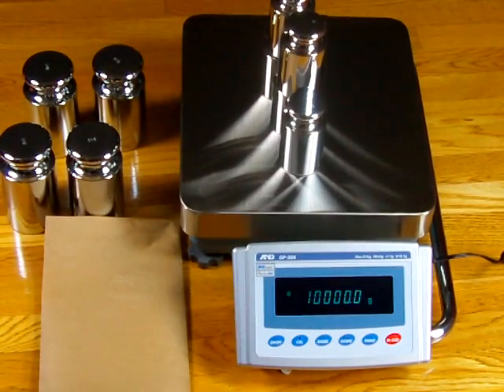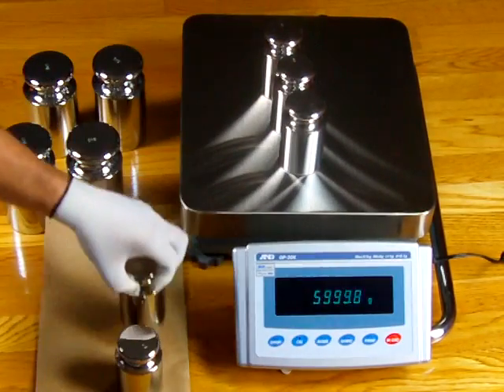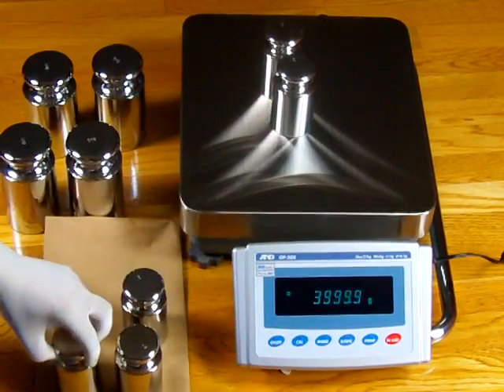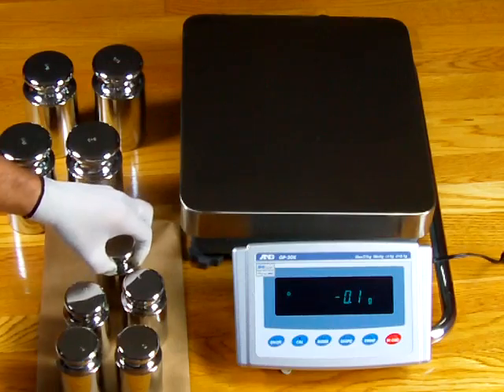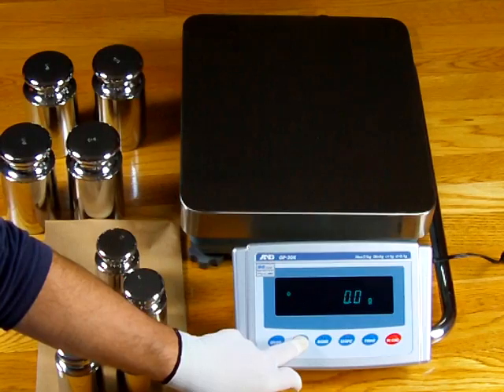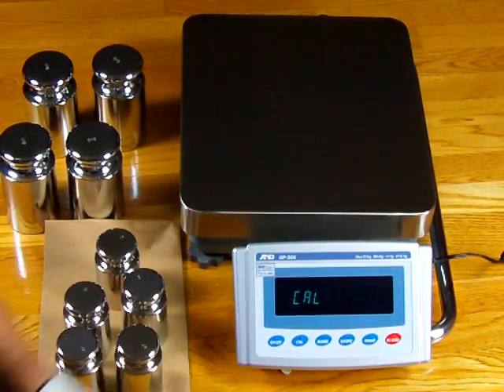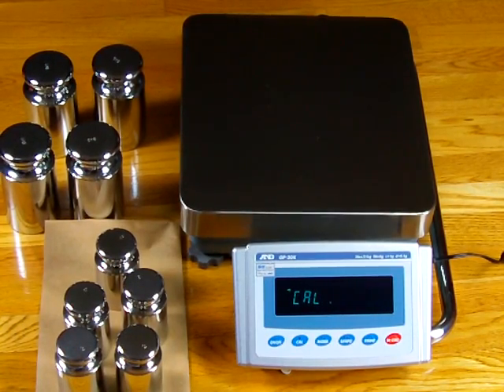Doing an external calibration, you will get much, much better performance out of the balance. 10 kilograms is 10 kilograms, right on the money. But one more time to show you what happens with internal calibration — especially on high-capacity balances — if you're ISO, you're definitely going to have to do an external calibration. Now we're doing an internal cal again, and it's going to wipe out what we just did for the external calibration.